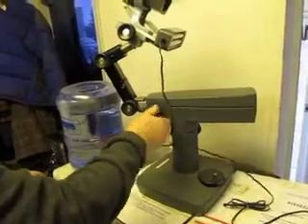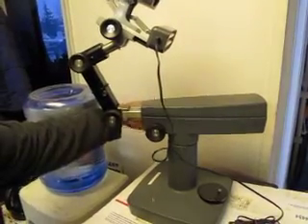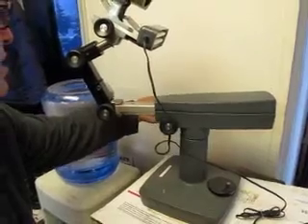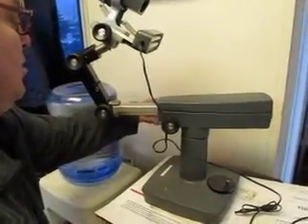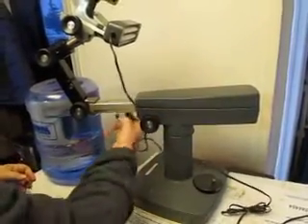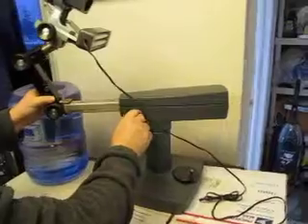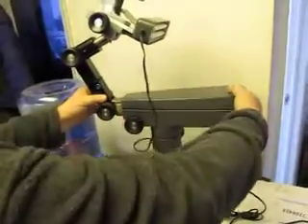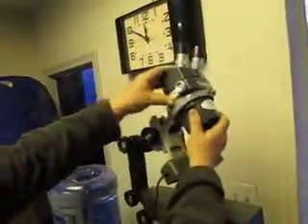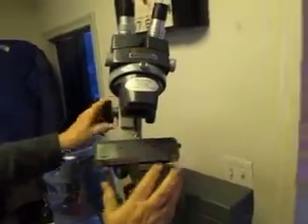The only problem we see with it is this goes out — as you can see, you've got to pull it out like this — but we can't make it go back in. I'm not going to take it apart; there are a couple of screws, but I don't know how to do that. Everything else kind of works and appears to articulate and work pretty well.